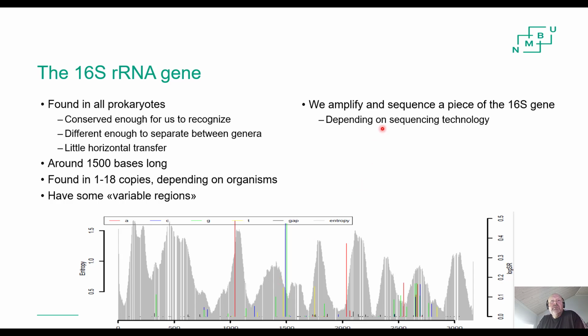And for the long read technology, you can even amplify the whole operon and sequence the whole operon, not only the 16S, because 16S gene is part of an operon with 23S gene and so on. So that's possible then. But with Illumina, only these shorter fragments, and that's what we focus on now.